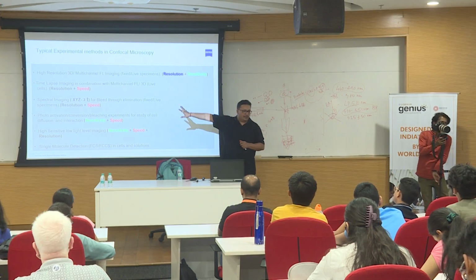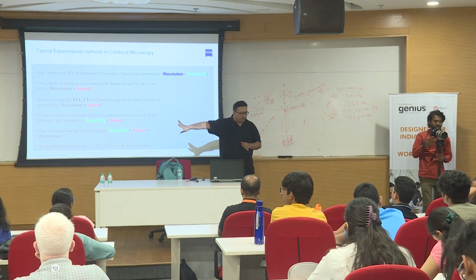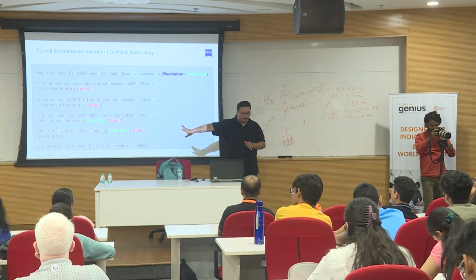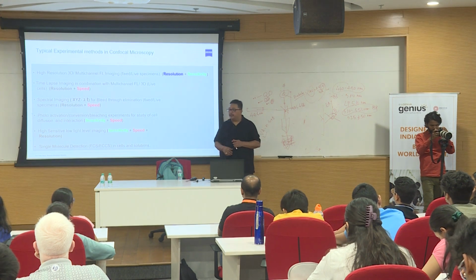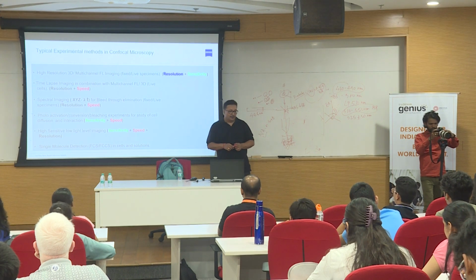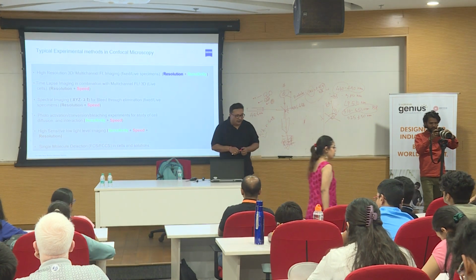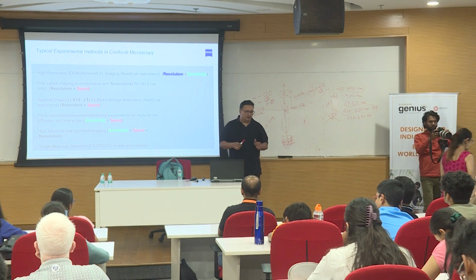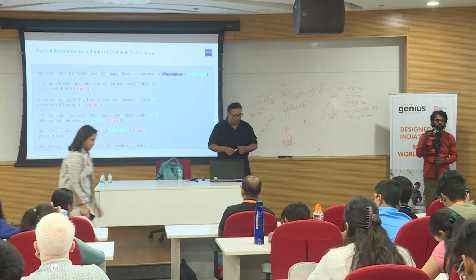And the same thing applies to a confocal. On a confocal, what is a detector? Your eyes? No. It's not the camera. These are special detectors, what you call PMTs, photomultiplier tubes, or some refined detectors like what we call GaAsP, gallium arsenide phosphide detectors. So it all depends upon what type of detectors you are using. Good.